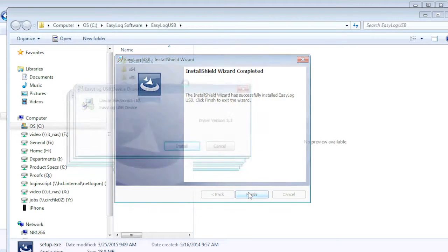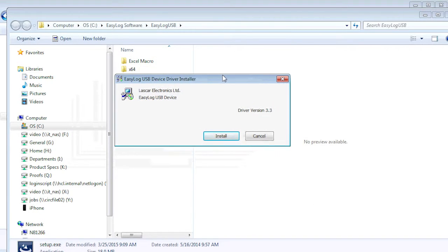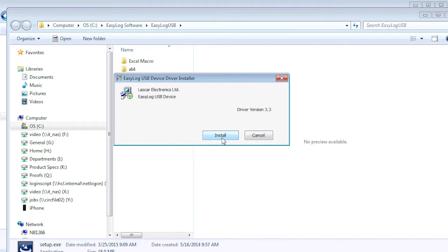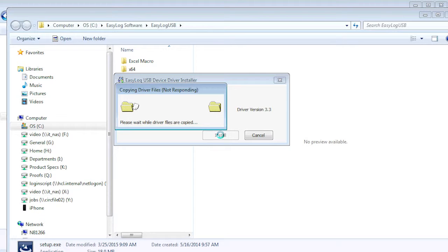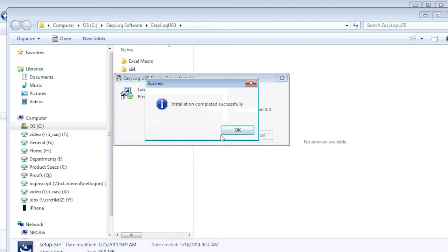After another brief moment, the device driver installation will begin. Click on Install. When prompted, click on OK after the driver installation is complete.